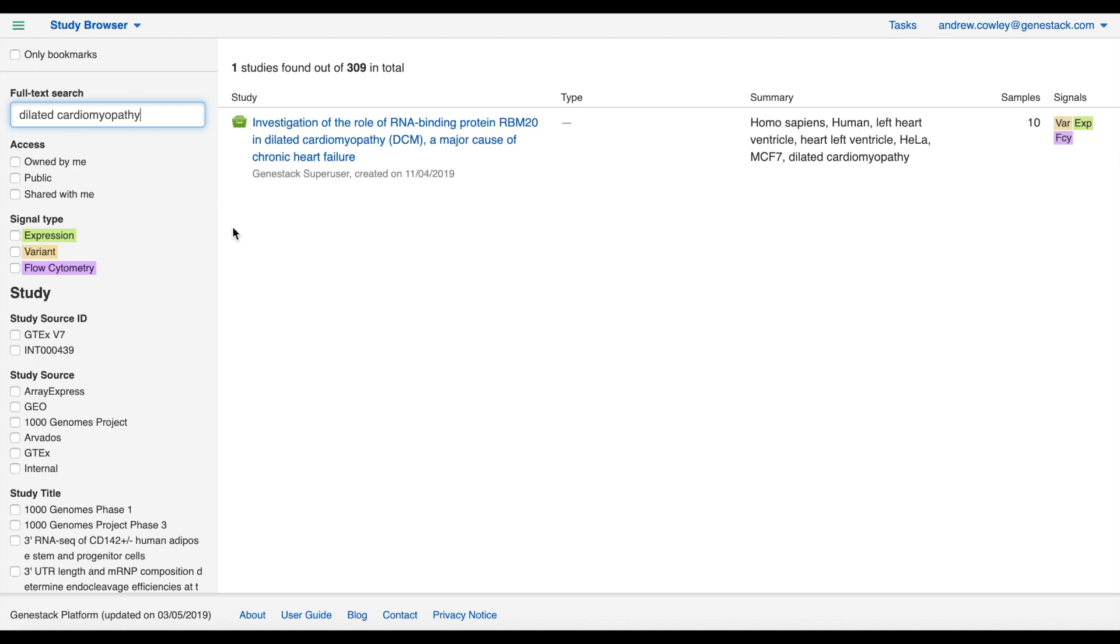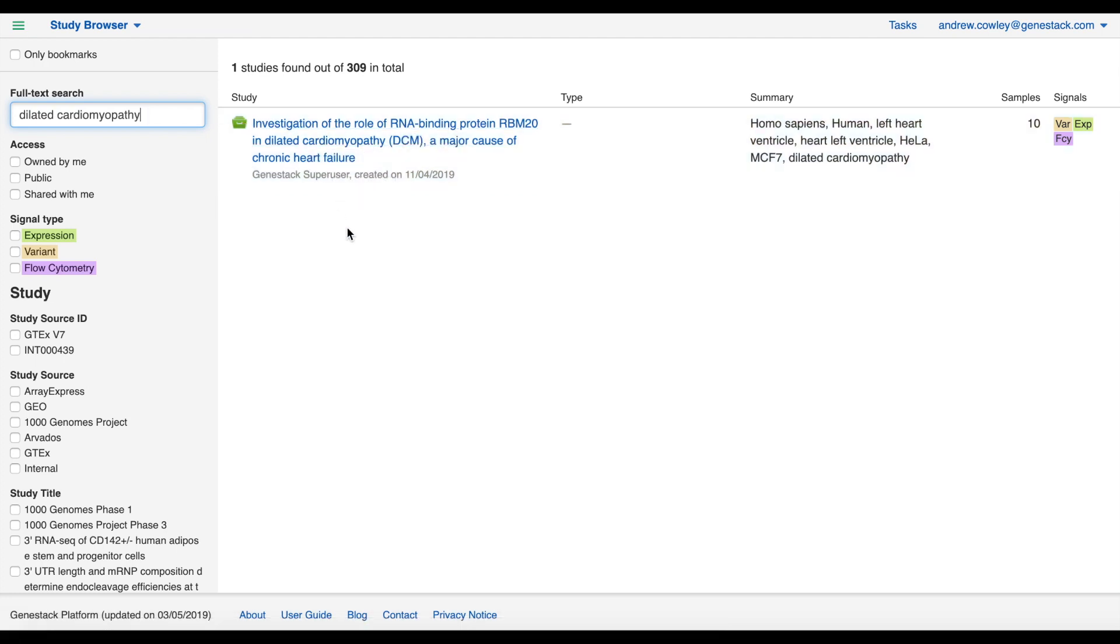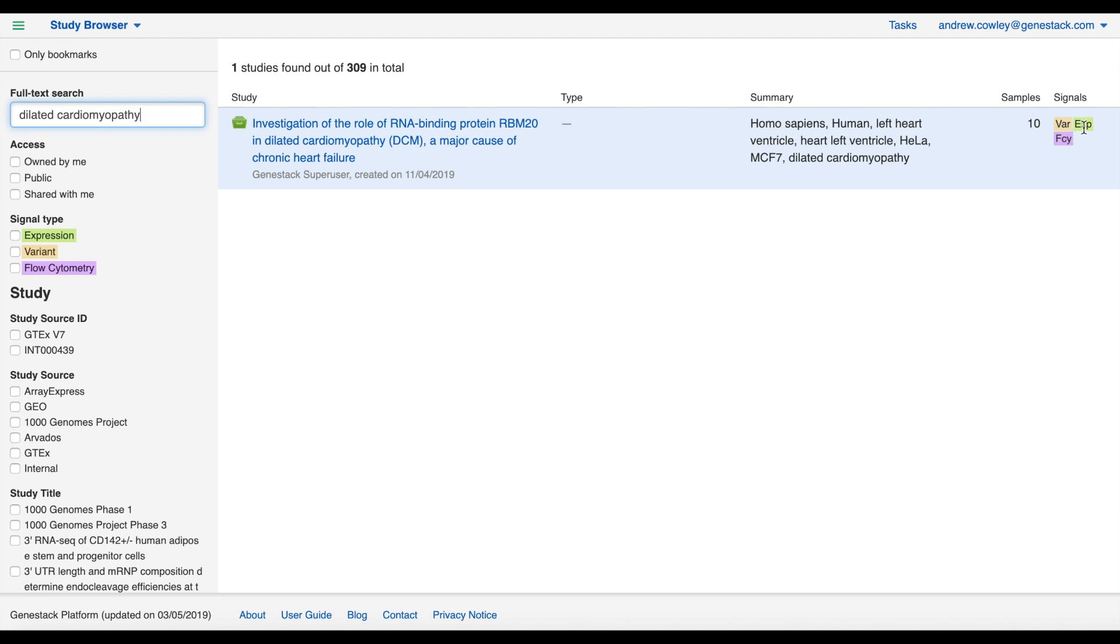Now we've actually pre-loaded my version of ODM with some test data, so it might not look like this for you, but I've got one dummy study in my results called 'Investigation of the role of RNA binding protein RBM20 in dilated cardiomyopathy.' I can see a summary of the metadata values and I can see that it has data in all three signal types: expression, variants, and flow cytometry.